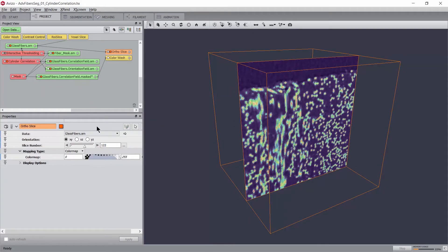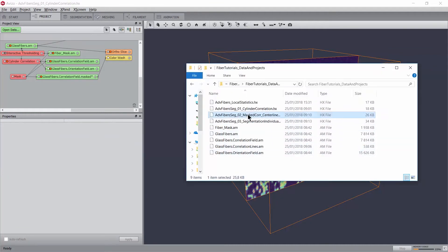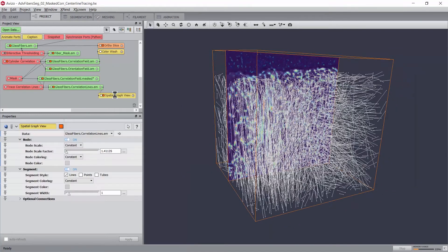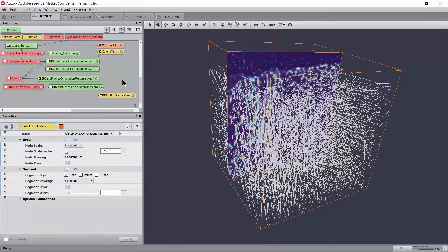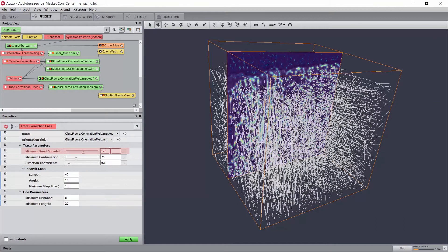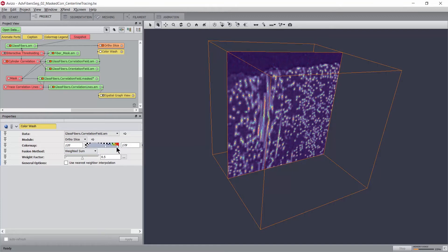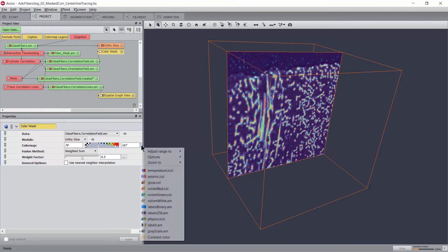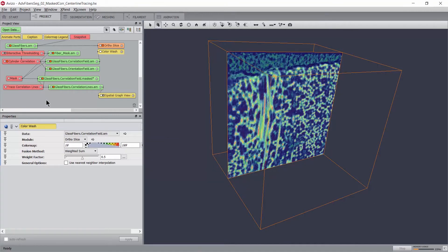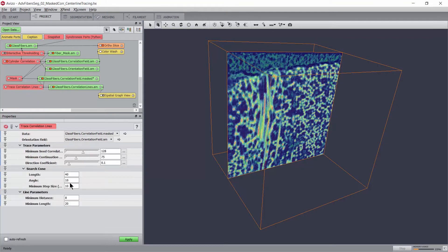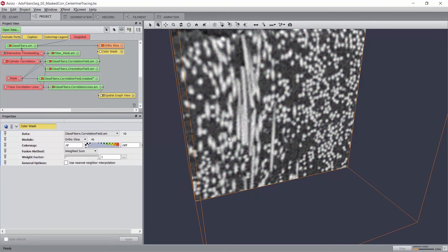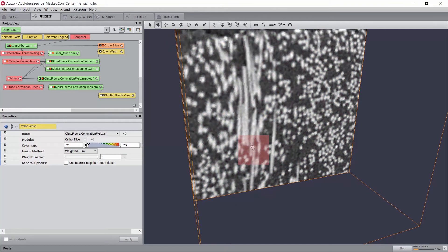Now, the centerline tracing stage can be performed using the masked correlation and the orientation field. You may try setting the corresponding parameters by yourself, or check against the values proposed in the project file. I used here a relatively low value for the minimum seed correlation — in practice, I observed that otherwise I had some missing fibers. Thanks to the masking of the correlation field, I was also able to go to a relatively low value for the continuation quality, which helps to get to the extremities of fibers. Since short glass fibers remain very straight, I use a search cone with a narrow aperture angle, and further use a low value for the direction coefficient, so that I enforce straightness of the tracing and limit the chances that tracing may jump on a neighboring fiber when reaching an extremity.